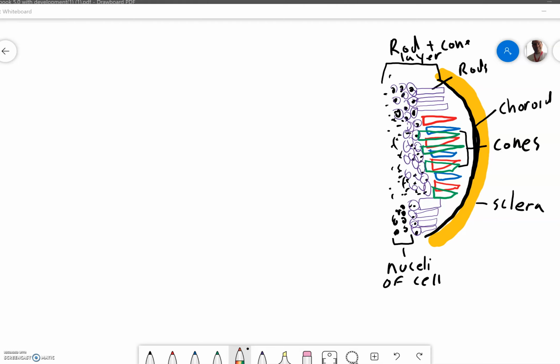Next layer of cells is our bipolar layer. And remember, the rods and cones are very dense. They're very dense as well, but it depends on where they are. If it's over where we only have rods, like the periphery, you're going to have fewer bipolar cells than you would here because rods converge on bipolar cells, cones do not.